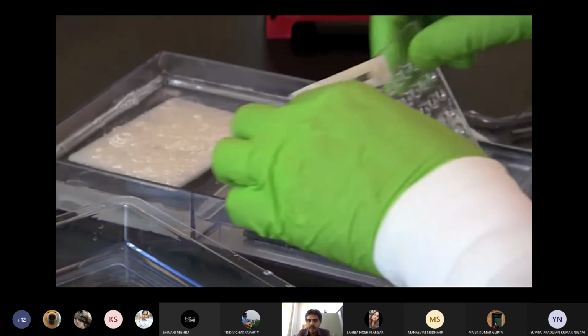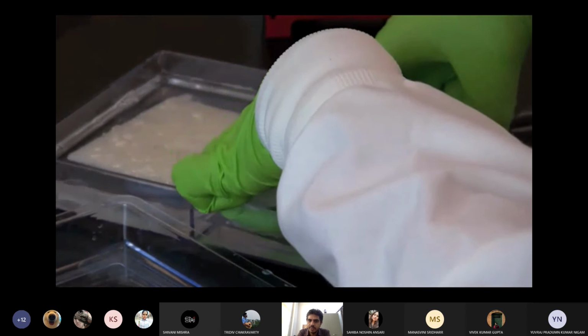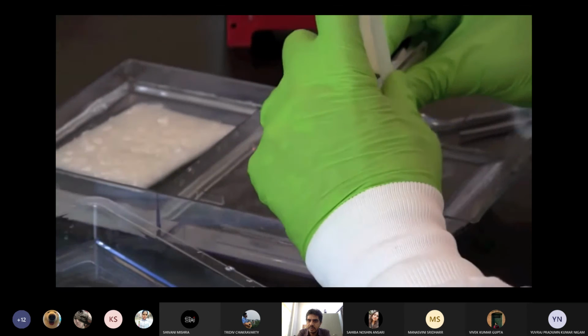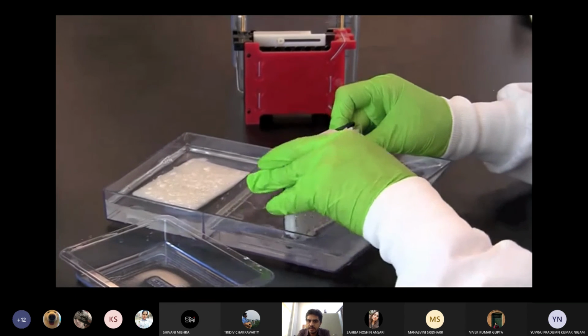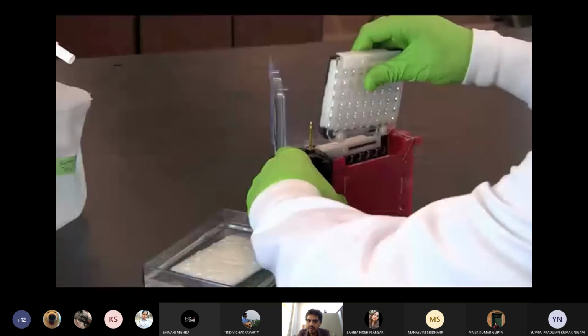Now close the gel holder. Fold the clear plastic side of the gel holder over the sandwich and clip it. So the black plastic side we are talking about, sliding over the white clip. We are putting it very tight, so this tight fit will squeeze the sandwich together. Your gel and membrane become very close to each other. So no air gap should remain.